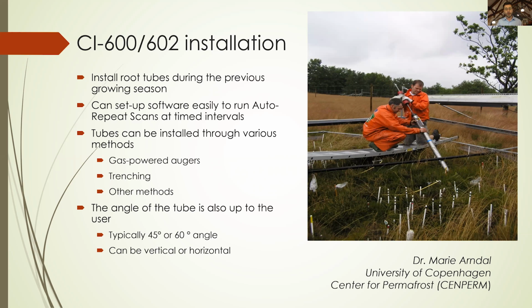There are many methods of installation I also want to mention. We do typically suggest using a 45 or 60 degree angle. This is a little bit for historical reasons, as well as it helps keep out things like rain and other environmental factors. But this instrument actually works either vertically or horizontally as well. I'll show you a little later in the presentation that you can install it in a lot of very ingenious different ways.